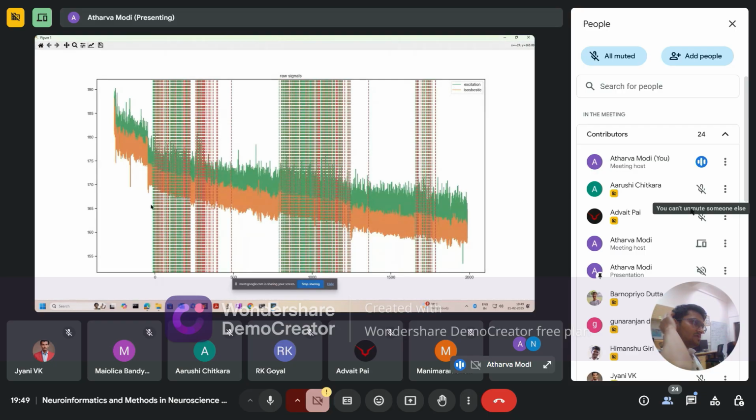This may happen because probably there was light turned on before this time, the ambient light, and then I closed the doors of the setup, so that both the signals went down together. It is generally recommended in every library that you will find that you need to see these kinds of artifacts manually, and figure out whether the data looks good or not in general. Do you find these kinds of abrupt changes within the session? You have to do some manual checks on the broader scale as well as minor scales also.